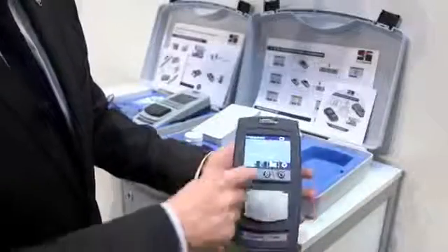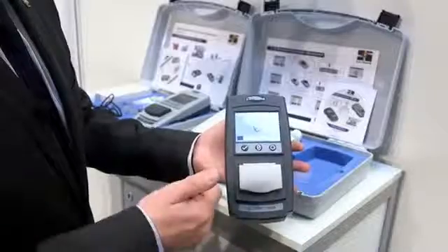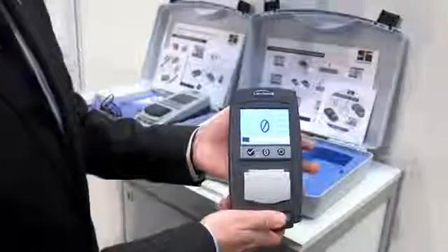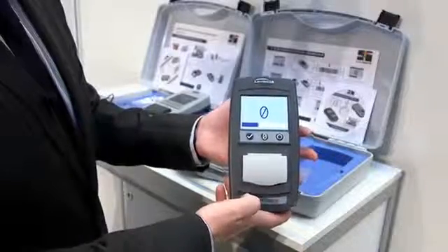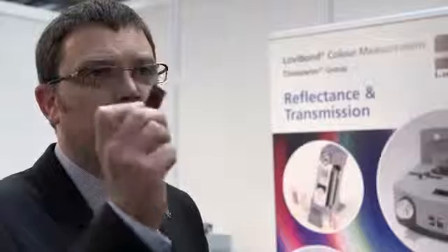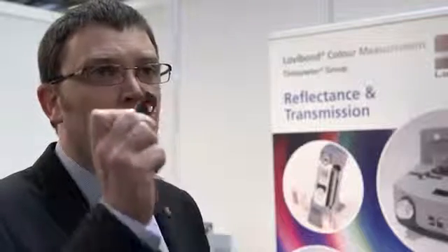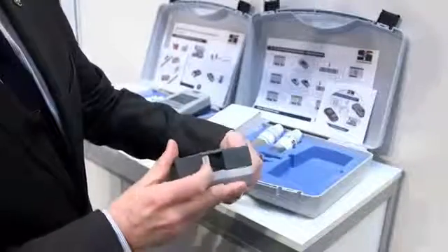We have a nice clear visual display. You can zero the unit as you would with any other electronic instrument, so you know you're going to get good, reliable readings — that takes a few seconds to do. With each unit you ship a variety of cells required for that colour scale, and to ensure compliance you get glass standards appropriate for the scale you want to measure. The unit is also powered by USB or by AA batteries at the back.